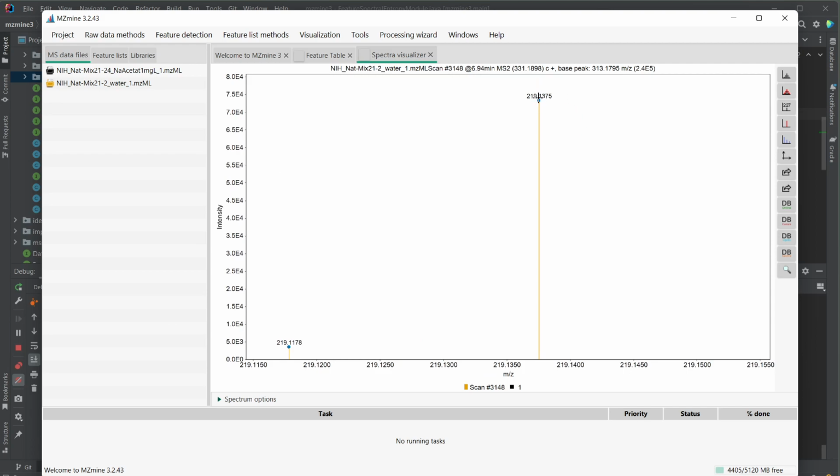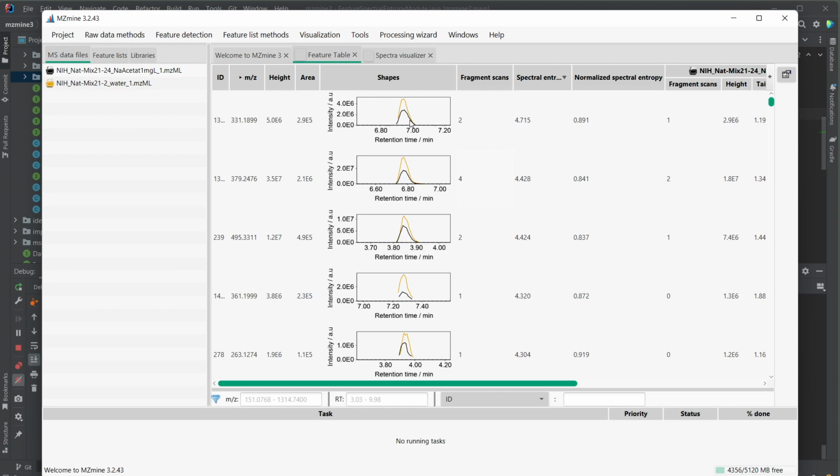So we only have one m/z and intensity, and we don't have a full profile of this peak in the mass to charge dimension. But just now, we've been using the raw spectrum. And if the raw spectrum is a profile mode spectrum, the spectral entropy does not make any sense. So a very important thing that we have to cover is that we actually don't run on the raw spectra, but rather the mass list.